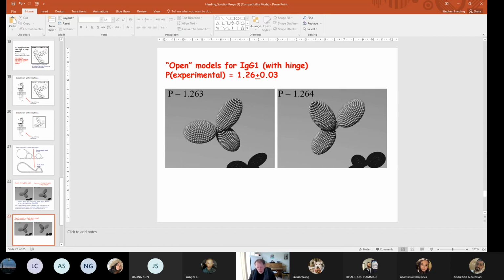That's how we can check whether a molecule, after storage or after some sort of manipulation, changing of an amino acid or whatever, has had an effect on the conformation of the antibody molecule. We can use this solution modeling of this type.